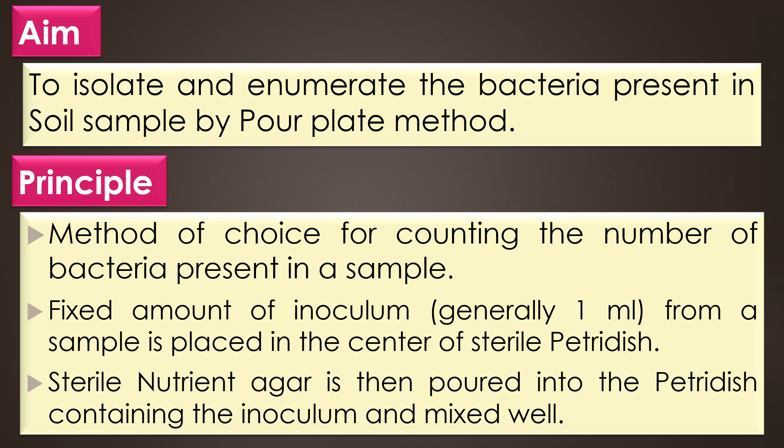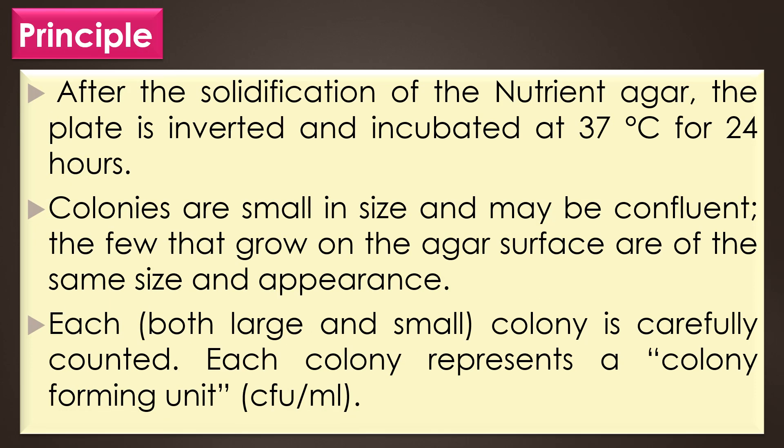Sterile nutrient agar, approximately 20 ml, is then poured into the petri dish containing the inoculum and mixed well. After solidification of the nutrient agar, the plate is inverted and incubated at 37 degrees Celsius for 24 hours.